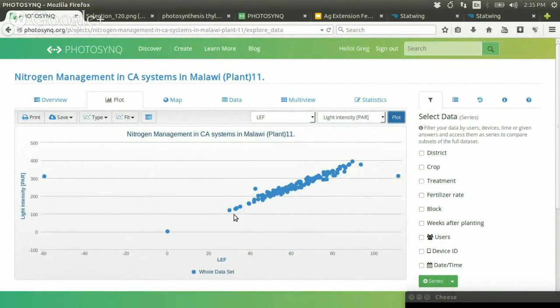I know this is a little bit technical, but it's actually quite important. So this curve is telling you for these plants how healthy they are. And when you see points that are way off this curve, either there's something wrong, and we can check for that. So here's an example point, like what's going on with that piece of data. It's certainly not in line with the rest. We can click on it.